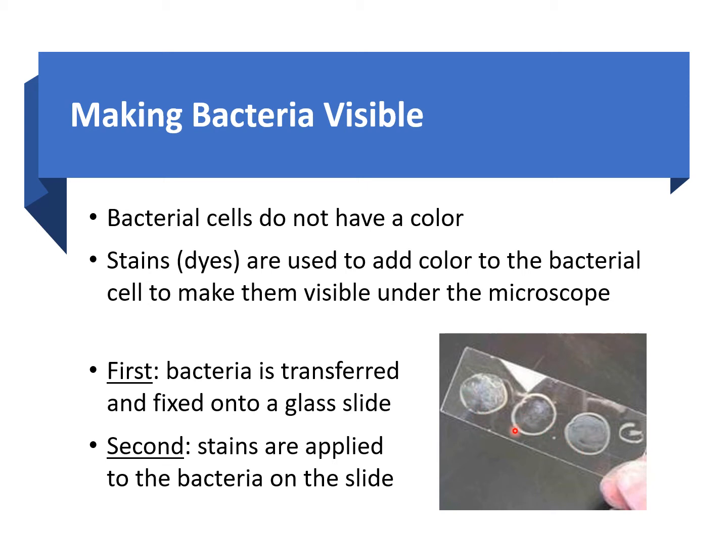Now, if you're going to put multiple different samples on it, you can use a crayon to draw circles on your slide so that you know that, okay, within this circle I'm going to put sample A, in this one I'm going to put sample B, in that one I'm going to put sample C.